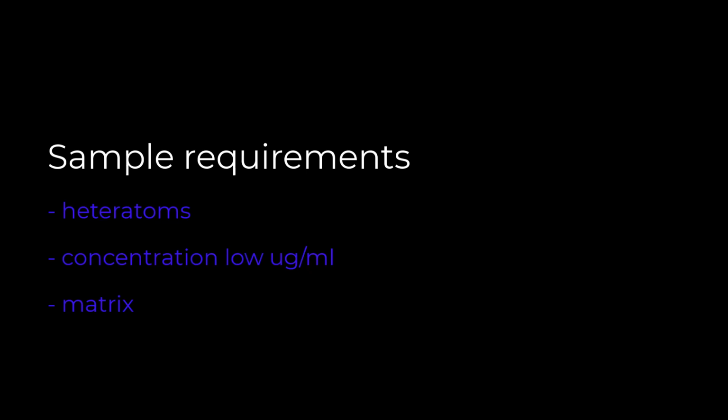Sample concentration should be approximately 10 microgram per milliliter but may be increased 1 order of magnitude to improve signal-to-noise. Users should always dilute their samples to low microgram per milliliter concentration and analyze these more dilute solutions prior to trying more concentrated solutions. Concentrations in the milligram per milliliter range should never be injected.